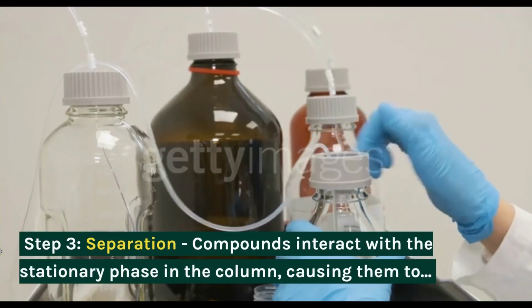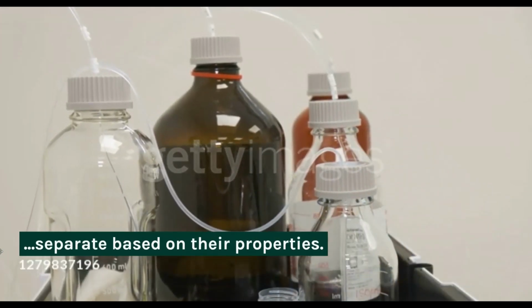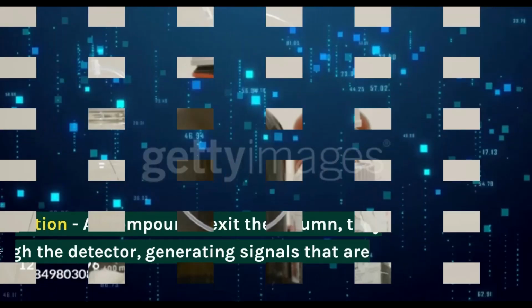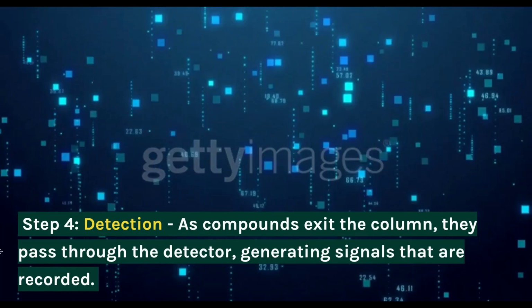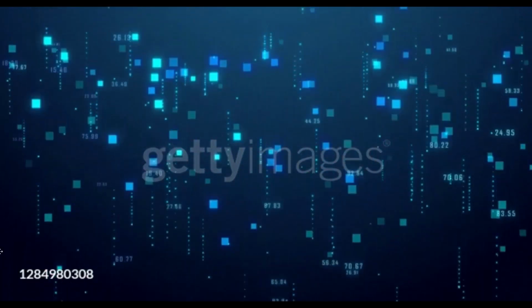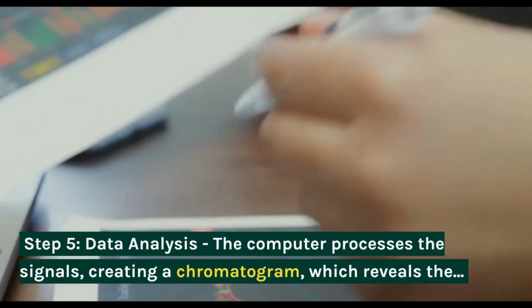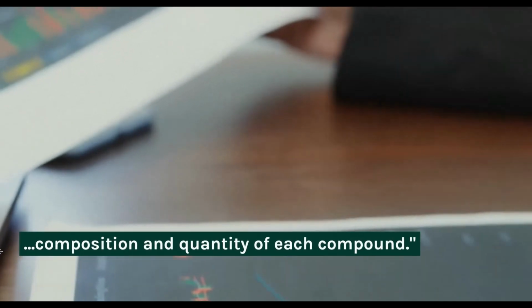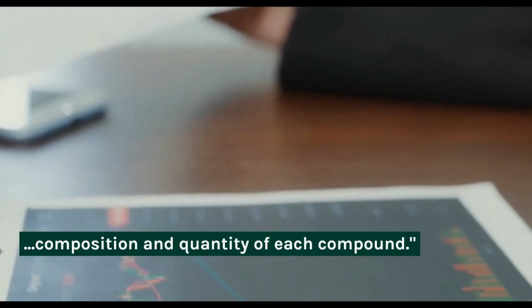Step 3. Separation. Compounds interact with the stationary phase in the column, causing them to separate based on their properties. Step 4. Detection. As compounds exit the column, they pass through the detector, generating signals that are recorded. Step 5. Data analysis. The computer processes the signals, creating a chromatogram, which reveals the composition and quantity of each compound.